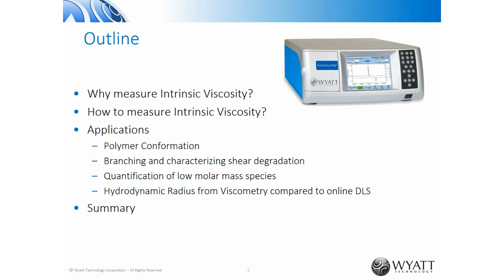I'm going to begin today by talking about intrinsic viscosity, why you should be interested in measuring it, how to measure it, and some of the technical difficulties involved in making such a measurement, and how we've overcome them. And then we'll follow up with a series of applications.